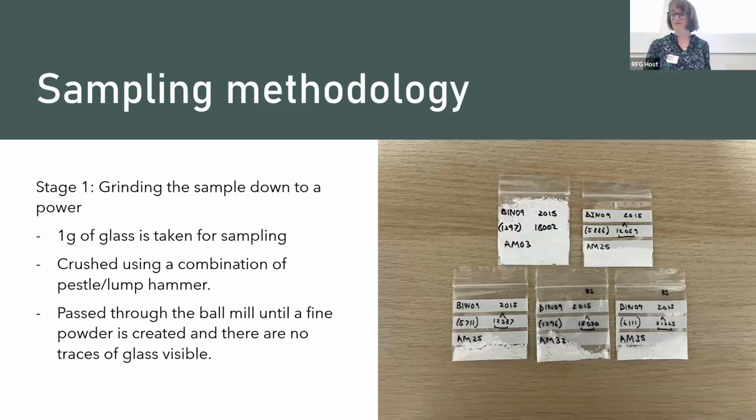So, the process of grinding up samples and forming them into pellets for XRF sampling is a fairly common process within the study of ancient ceramics, but isn't often used as much in glass.